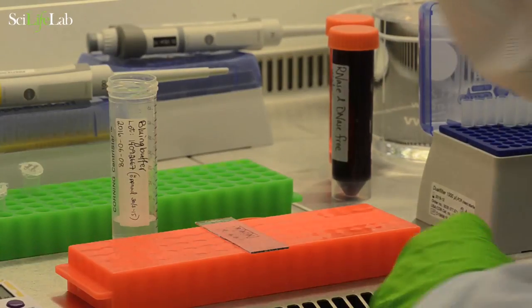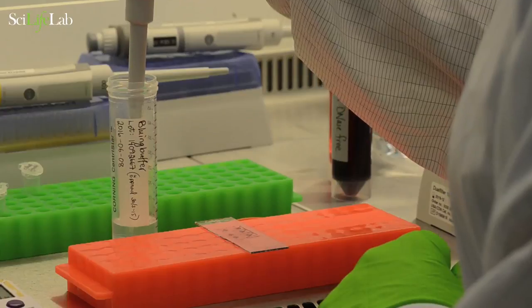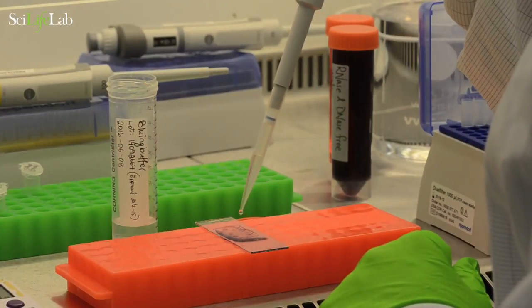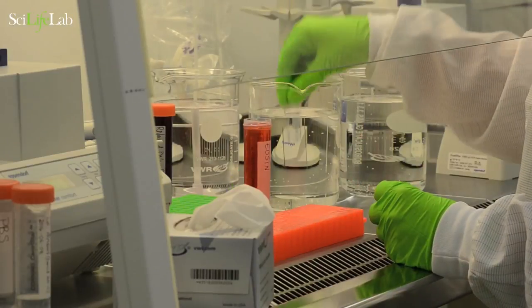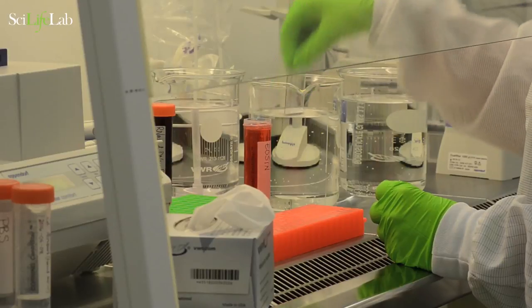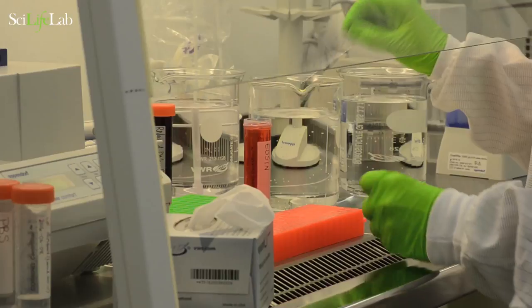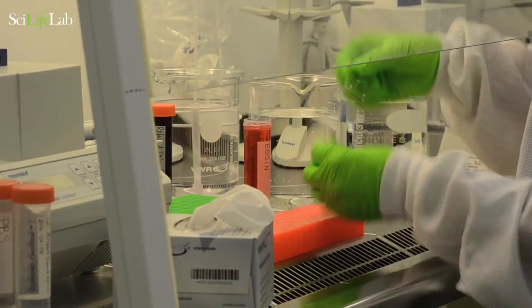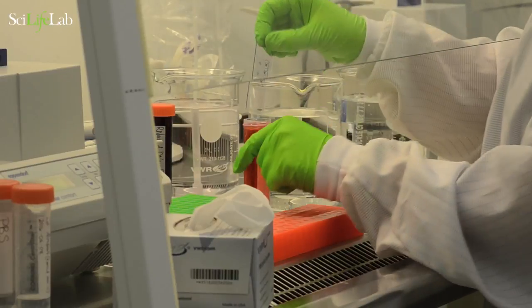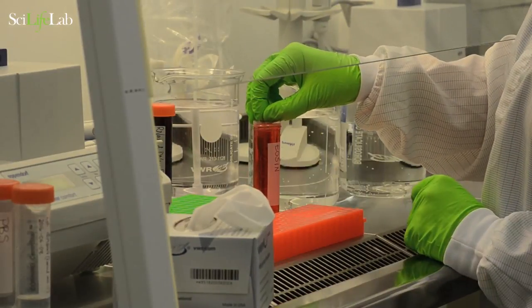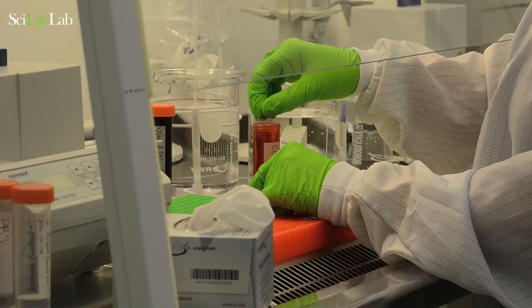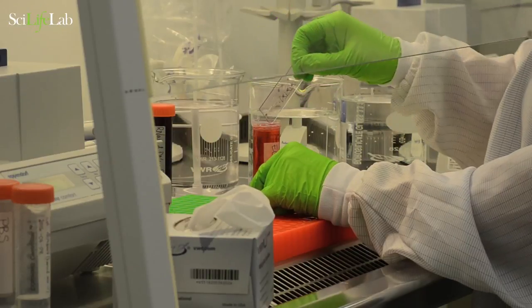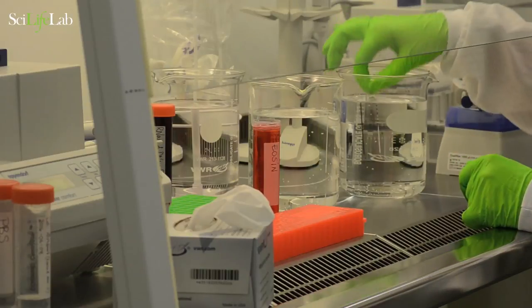Add bluing buffer and incubate for two minutes at room temperature. Dip the glass slide into water to wash off the bluing buffer. Then dip the slide into pH 6 buffered eosin for 20 to 40 seconds. Wash off the excess eosin in a beaker of clean water.